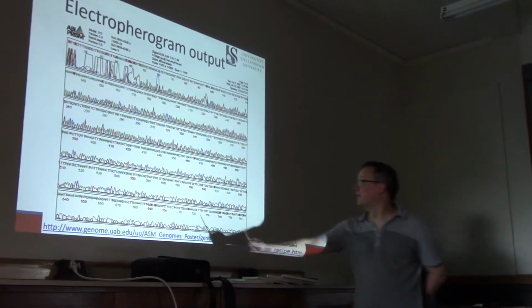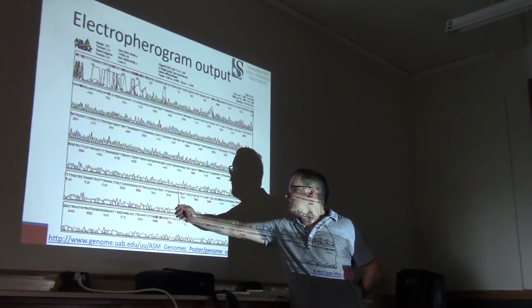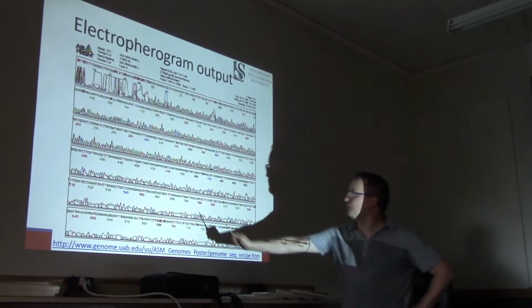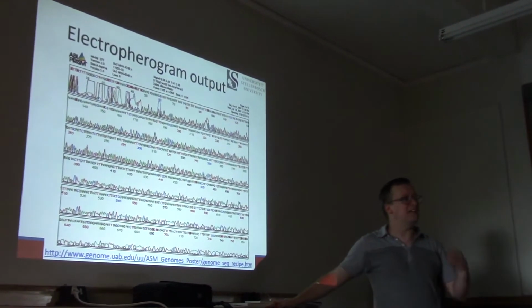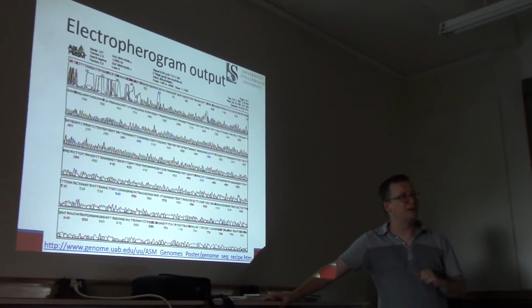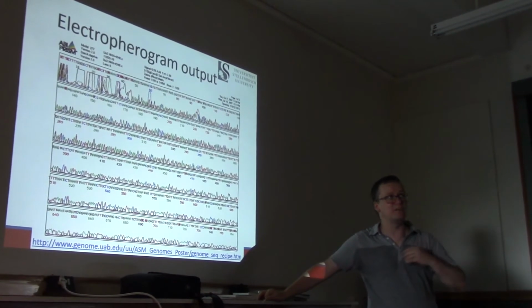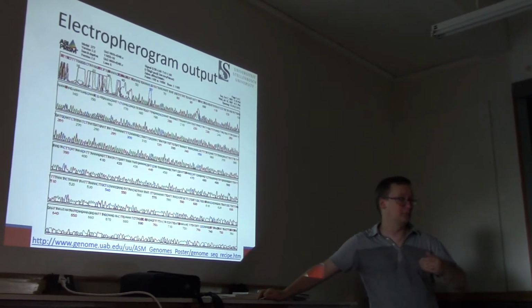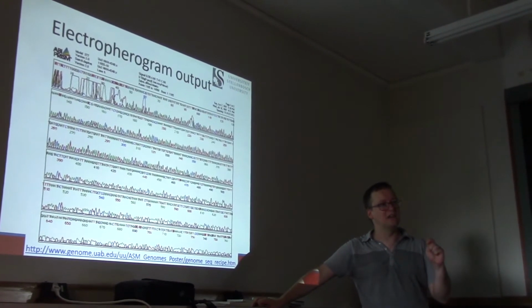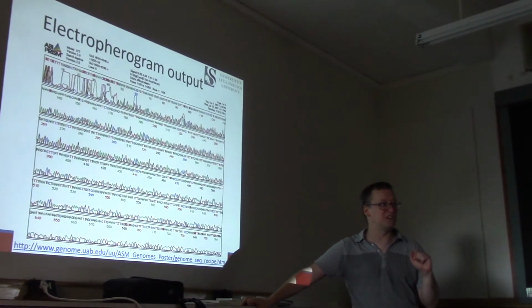Okay, I'm going to claim that this position at 450 looks pretty good to me. I've got a nice strong green signal. There's very little other color that's getting a bump at that spot. I feel pretty sure about this, but I need to quantify that. I need to pin it down. I'm going to argue we're much better than coin flip territory. I'm even going to say we're better than 9 in 10 of getting it right, or less than 1 in 10 of getting it wrong. But am I capable of pinning down whether that's a 1% chance of error, or a 1 in 1,000 chance of error, or a 1 in 10,000 chance of error?